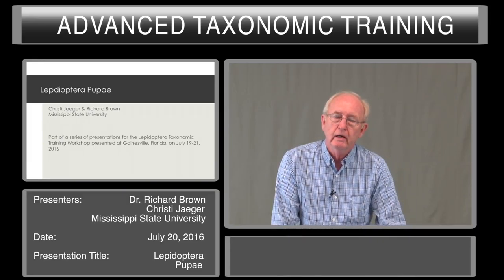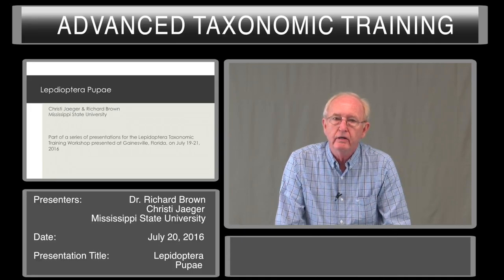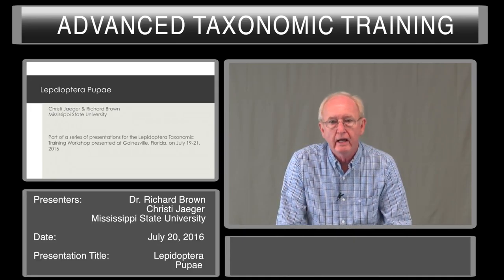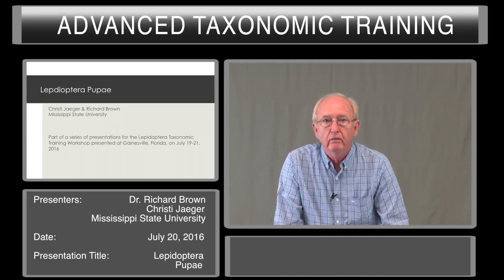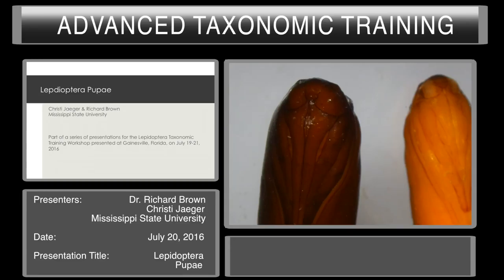During this workshop you will hear a lot about the caterpillars that do the damage, and the adults and recognizing the adults. You've just heard about the eggs of Lepidoptera. Now we will discuss the pupae of Lepidoptera. In this demonstration we're going to key out a pupae to family level using Steve Passoa's guide to some pupal Lepidoptera with emphasis on frequently intercepted species. The characters we use are provided in our pupal lecture by Dr. Richard Brown.